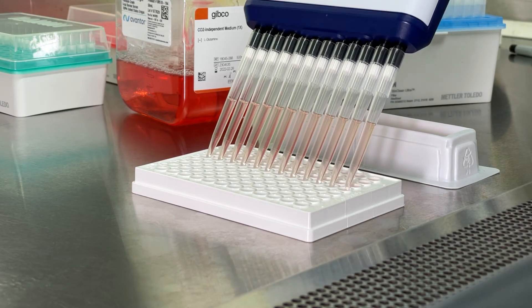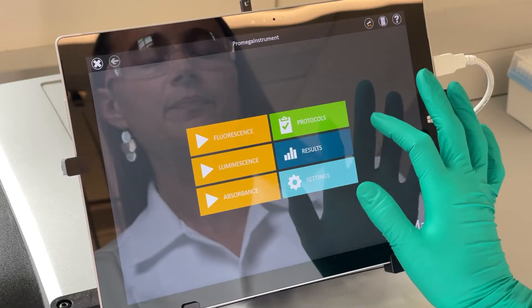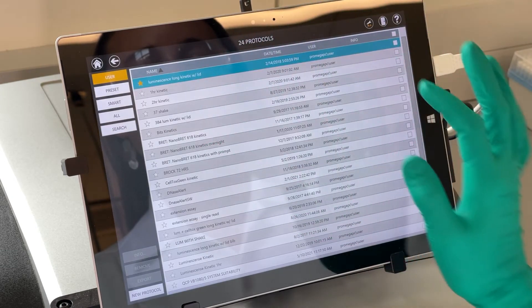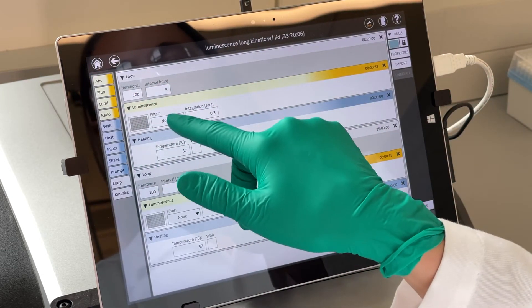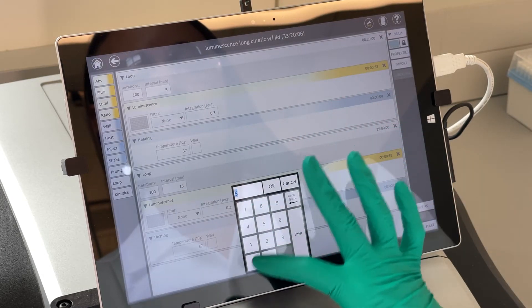For this type of assay, I like to use NanoGlo and Durazine with CO2 independent medium. I select the pre-installed protocol in the simple, intuitive GloMax software. I can easily set it to take readings as frequently as I want — I usually read every 10 minutes for this type of experiment.